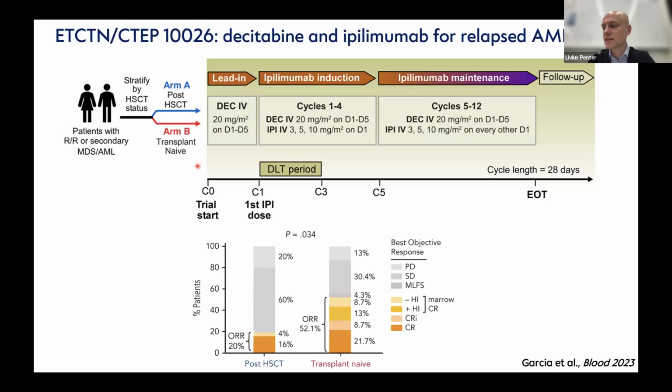So this was really a very nice opportunity to understand responses and non-responses on this trial and following this therapy. And one of the interesting aspects of this clinical trial was that there were quite a few responders. So we had plenty of opportunity to understand what's going on in the responders using those samples.